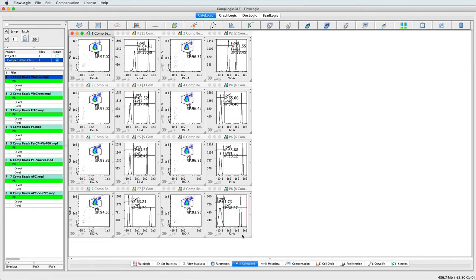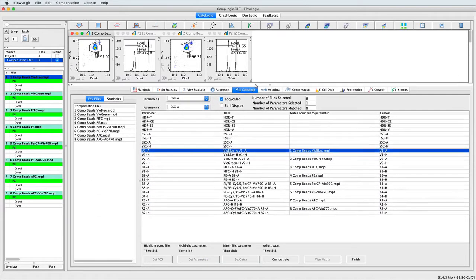If required, you can adjust the polygon gate, and as you can see in the File Inspector, the polygon gates have been grouped, so adjusting a polygon gate for one sample will update the polygon gate for all samples. Likewise, the histogram markers can also be adjusted so that they accurately fit the positive and negative populations. Once the setting of the histogram markers is complete, return to the Advanced Functions pull-up drawer and click Compensate.